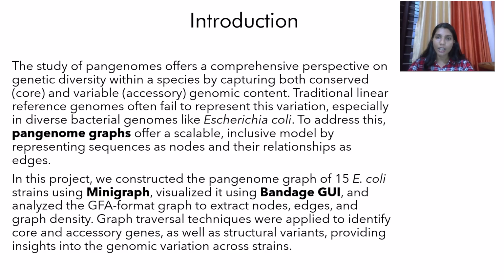In this project, I used 15 different E. coli strains and I built the graph using Minigraph, visualized it with Bandage GUI, and analyzed the graph structure looking at nodes, edges, and the graph's density. Then I applied algorithms to identify core and accessory genes and even structural variations across strains.